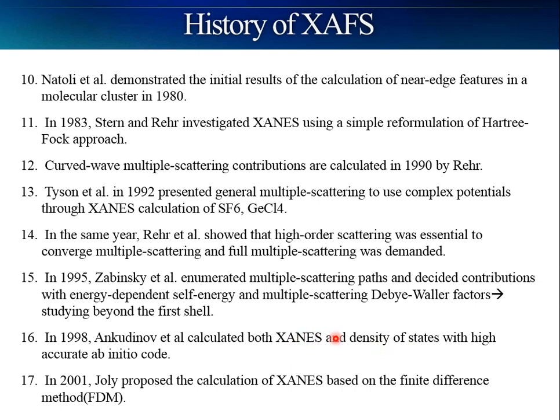However, I would like to recommend another program. In 2001, Joly proposed the calculation of XANES based on the finite difference method, which is FDMNES. If we want to calculate the XANES from first principles, I would like to recommend FDMNES. It's free software. Okay.